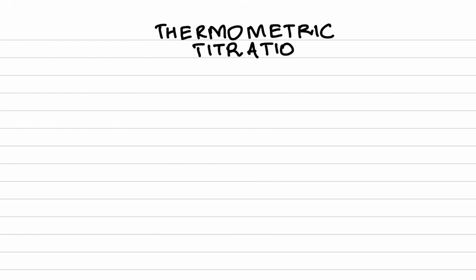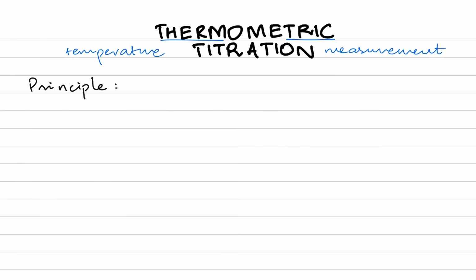In today's video of AS level P3, we will be talking about thermometric titrations. Thermo, like we mean temperature, and metric means measurement. So thermometric means we are going to be measuring temperatures.